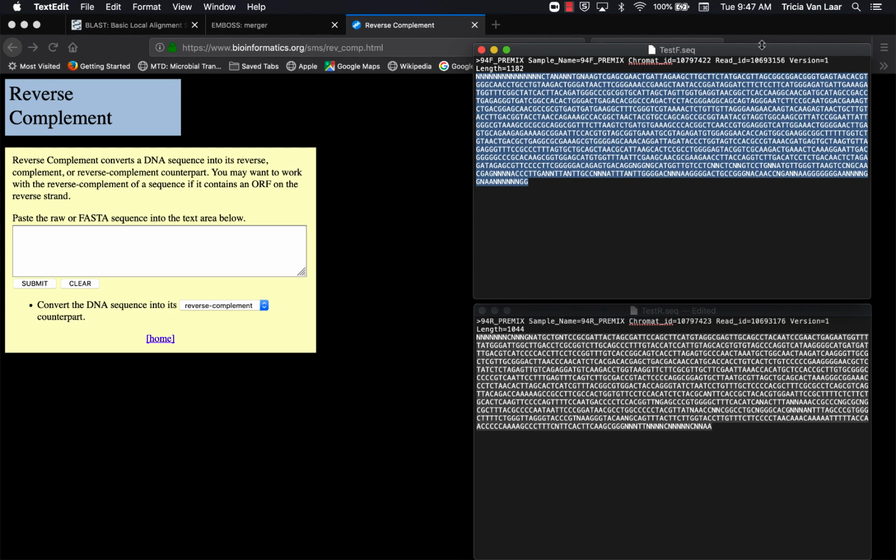Okay, today I want to show you how to do your sequence identification to identify your isolate. Unfortunately, because of the shutdown, we were not able to sequence your specific isolates. So we're going to be giving you sequences from last semester. And then you'll build your report for the final report in the lab based on the information that you learn about this particular isolate and the information you generated prior to us not being in lab anymore.